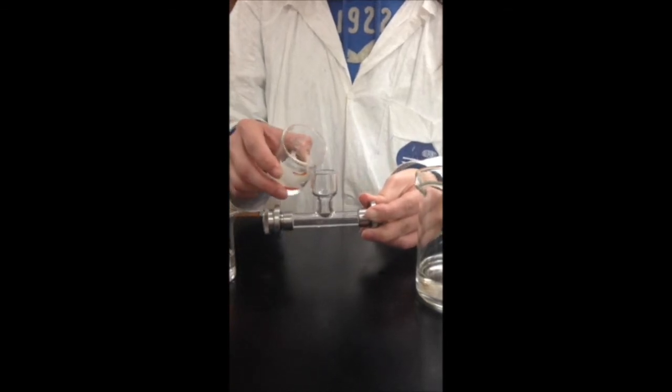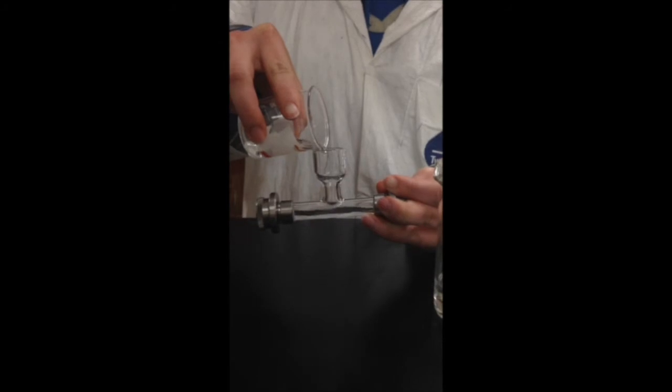Before you measure your sample optical rotation, you have to rinse the cell twice with about 1 milliliter of your sample first to avoid diluting the sample. Now fill the cell with your sample. Gently rock the cell back and forth. Just like before, you will clean the cell with a clean wipe. Clean the temperature probe first before you insert it into the cell.